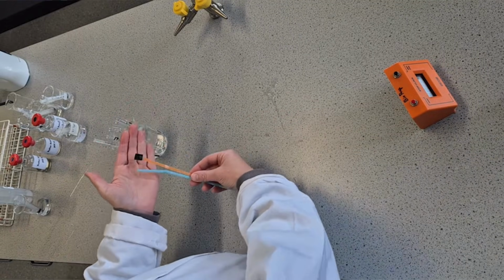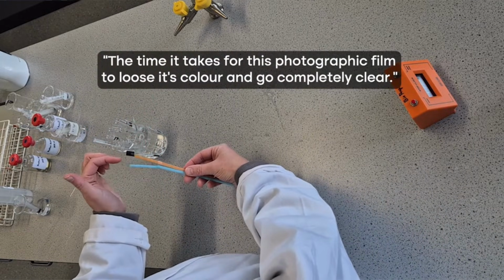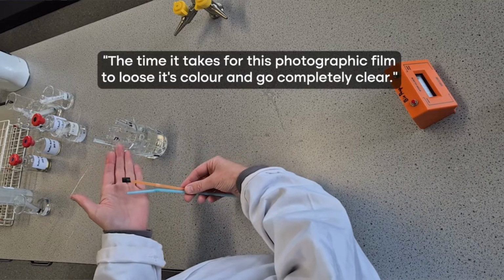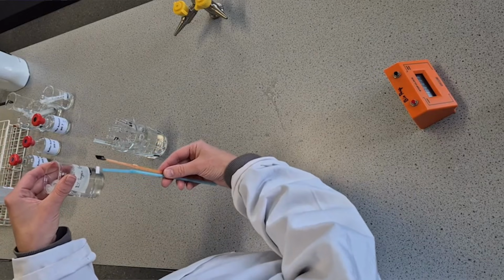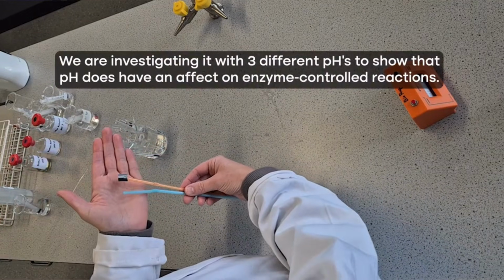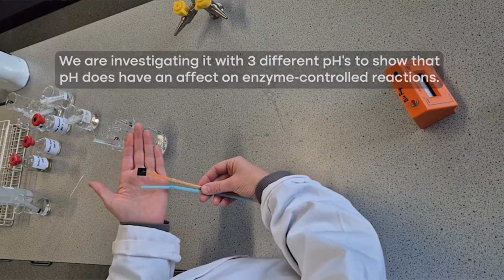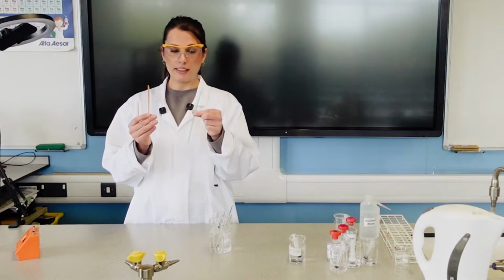So what we are investigating is the time it takes for this photographic film to lose its color and go completely clear. And that's because it contains gelatin. That is the substrate. Trypsin is the enzyme that's going to catalyze the breakdown of that. And we are investigating it with 3 different pHs to show that pH does have an effect on enzyme-controlled reactions. But we are measuring the time taken for that film to go completely colorless.